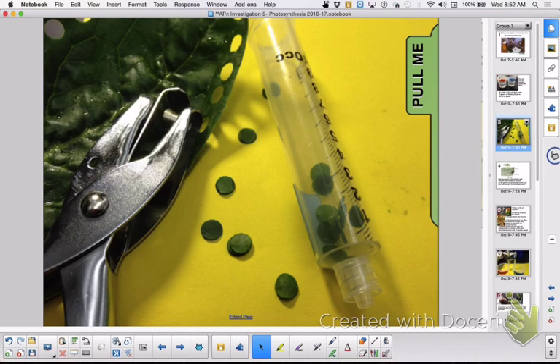Now, in order to get your leaf discs, what you're going to do is this spinach. Get yourself a good leaf and avoid the veins the best you can. And it's kind of annoying because they'll all stick together. You want to try to have 10 discs. When you run your two solutions, whatever you do, you want the same number of discs. If you can only get 8 sinking discs, then the other one has to have 8.